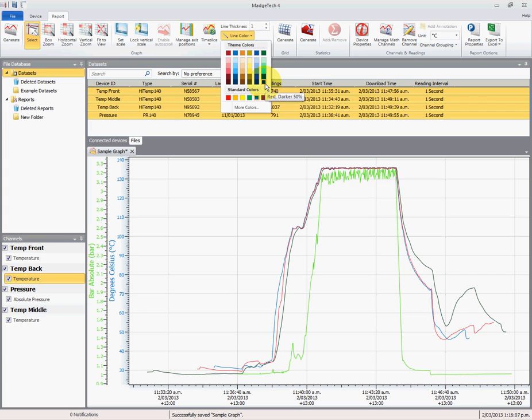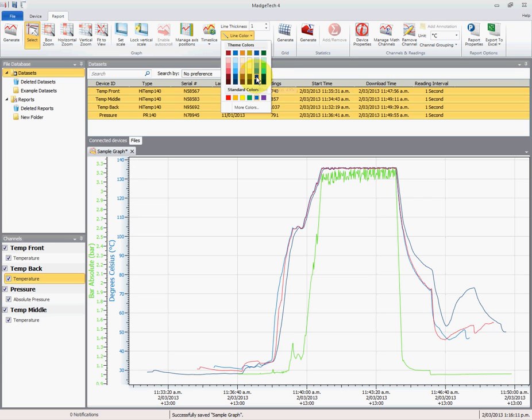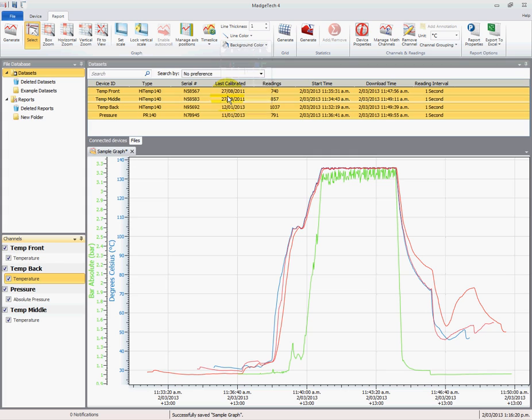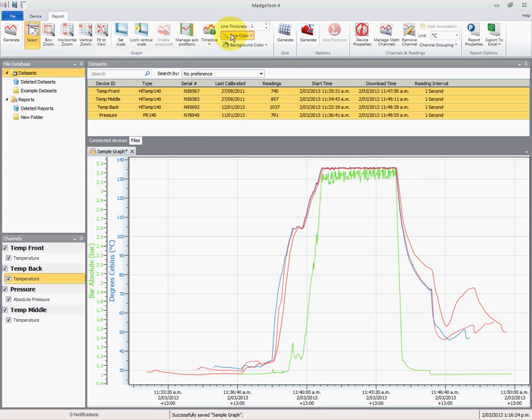I think that's it. Let's see if we can find a black. There's more of a bluey color, but that'll do, and we'll select red for that. Oh sorry, we're back on the same channel. We'll make that blue.